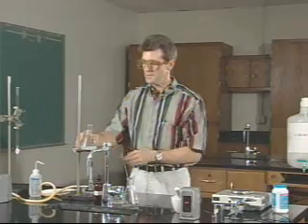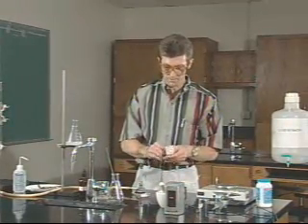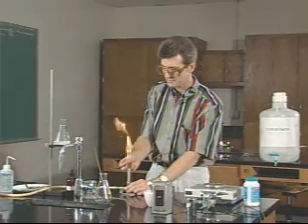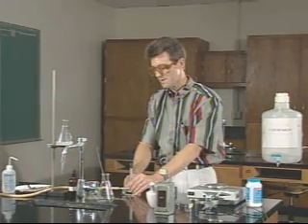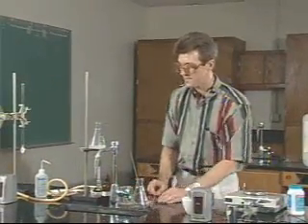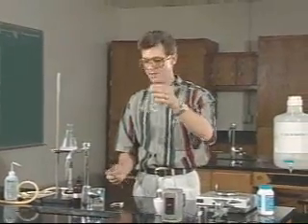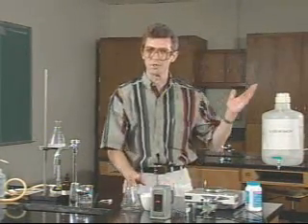We need to heat this to drive off any excess carbon dioxide, so we'll use a Bunsen burner and the ring stand assembly. We want a hot, non-luminous flame. We'll set this under the flask and bring it to boiling — it needs to boil for about a minute once it gets started. While it's heating, you should feel free to start a second sample by grabbing another flask and putting some more antacid material in. Remember to weigh the flask and then the antacid material, and go through the same motions with the autofill burette.